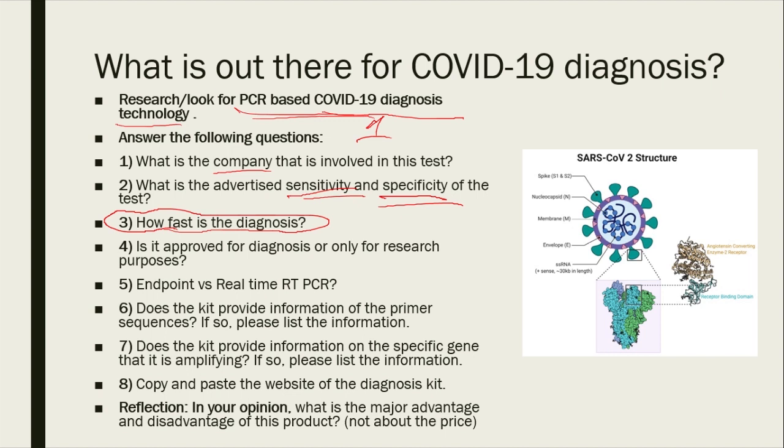Also, notice that a lot of these kits, some are FDA approved for diagnosing purposes. Some are only for research purposes. Whatever you can find is whatever you can find, but be able to realize, is this for real diagnosis that can be used in a hospital lab to tell people, hey, you have this disease, versus research purposes, something that Dr. Hong will use in his lab?